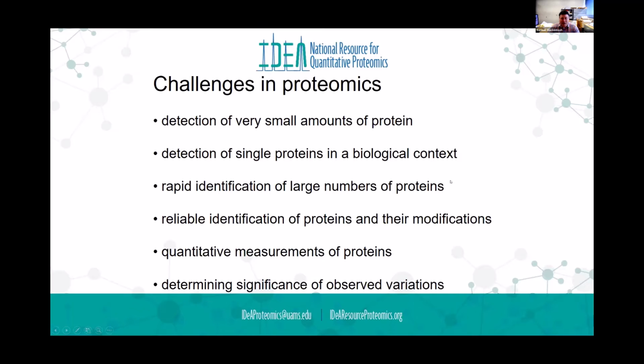And then, since you're dealing with complex samples, it's a challenge to make measurements of single proteins and single peptides in that context. Whatever it is we're going to do, we've got to be able to do it rapidly, because we're trying to collect a large amount of information. If it takes days or weeks to collect data on a single sample, then that just doesn't work very well. We've got to be able to do all of this reliably, as well as quantitatively and in a statistically valid way.